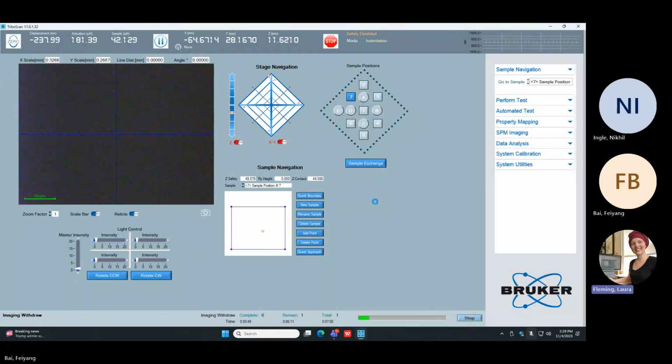And to answer Nikhil's question, yes, the purpose of this is to work with any sample, of course within reasonable height. If your sample is too tall, this will not work, but then it wouldn't work in any case. But yes, the goal is that for a sample of any height, if we bring the tip down and into contact, we can figure out the focal height based on the tip to optic Z offset.